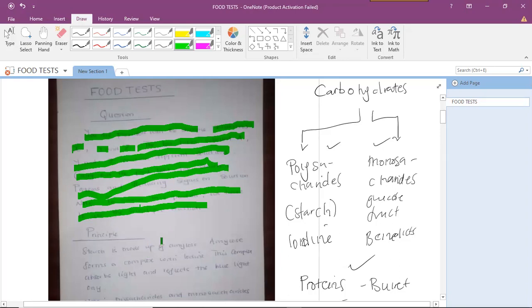Do not memorize the conclusions that you are going to draw. Your observations have to be in line with a valid conclusion, because you do not know the type of reagent that you might be given or what it contains. So it's very important to just take a deep breath and actually carry out the procedure well.